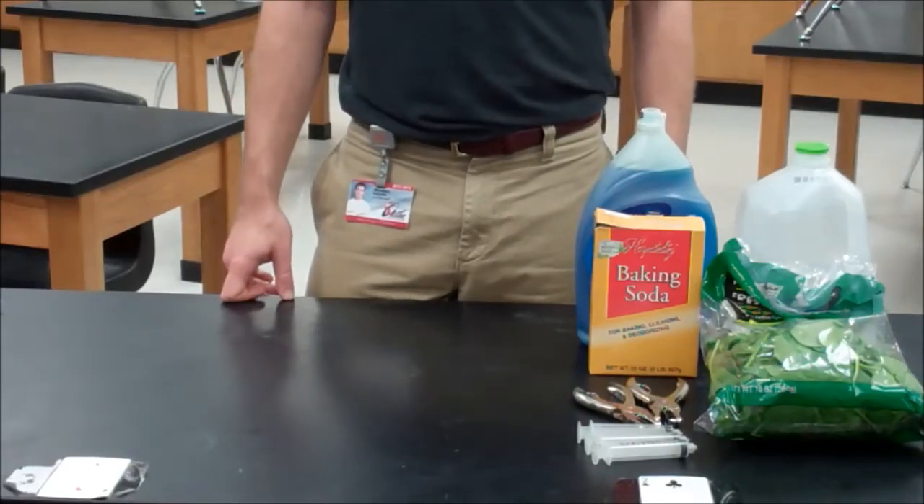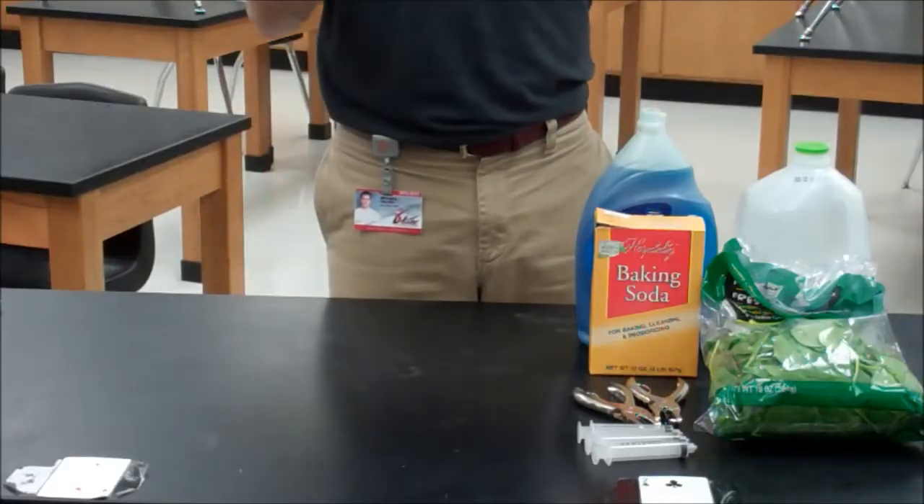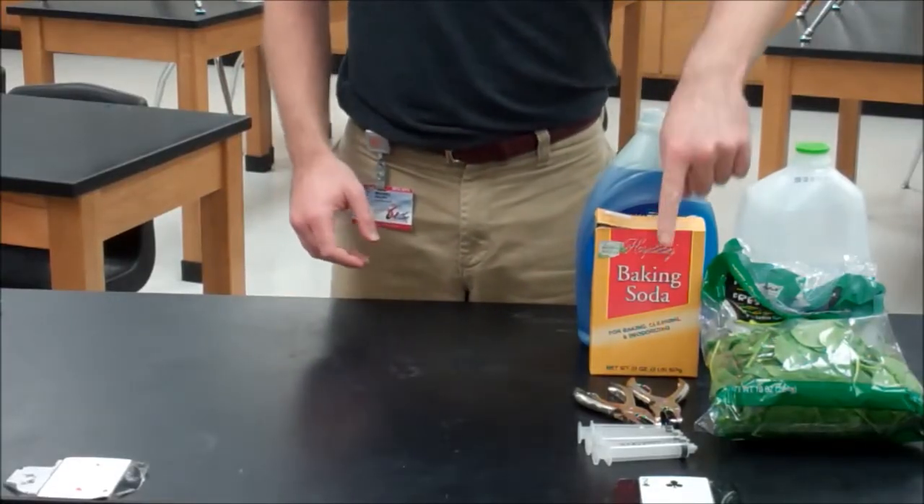Hi there, I'm Michael Ralph. Today we're going to be doing the Photosynthesis Floating Leaf Disc Assay. You're going to need everything you see right here, including soap, baking soda, and syringes.